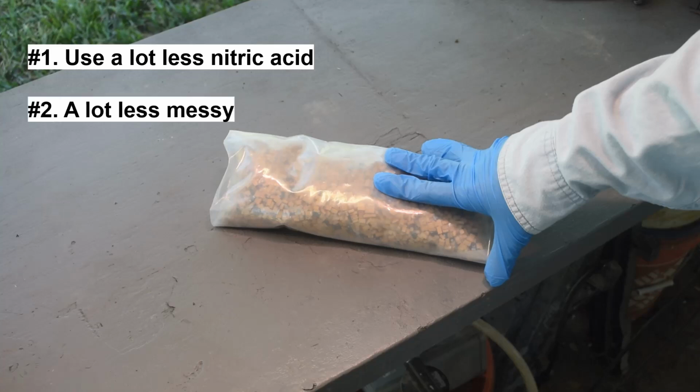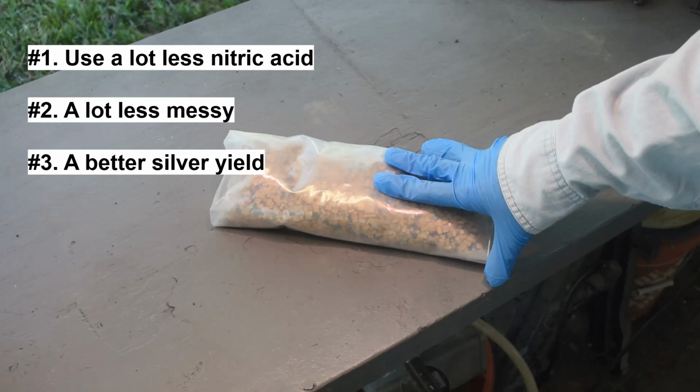Number two, I want it to be a lot less messy. We had what I call rust diarrhea in this stuff, which made the stuff really thick and gloopy and could have caused some of the silver loss if silver was indeed lost. So don't want to have that rust diarrhea again. Number three, a better silver yield. Got right around 1% last time, which I thought was kind of low. My buddy Jim thinks it's kind of low, and I agree. So this time I'd like to see a higher yield.